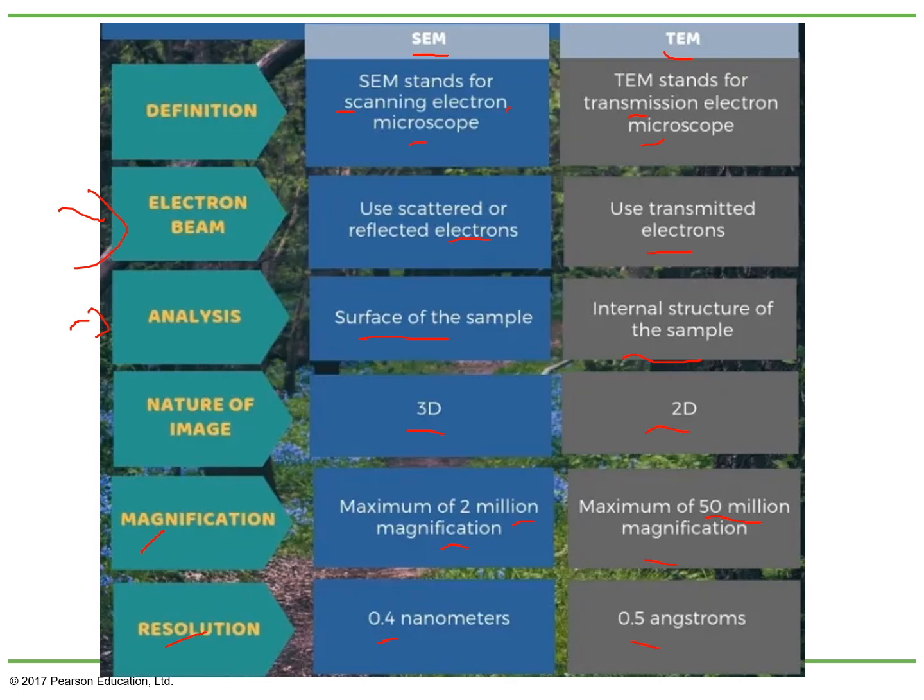You have to make them, you use different software to create those colors. So in other words, it could be very useful. It can give you a lot of resolution, but again, as usually with all microscopes, they have advantages and disadvantages. And here the super advantage is that it can give you a huge resolution.